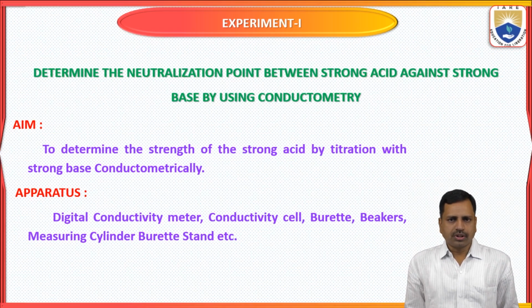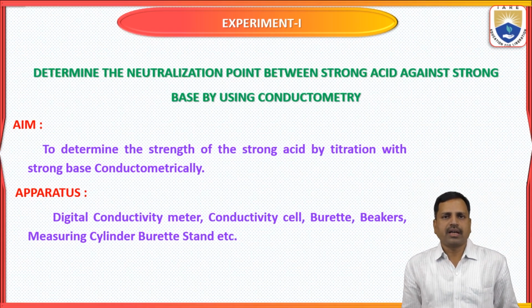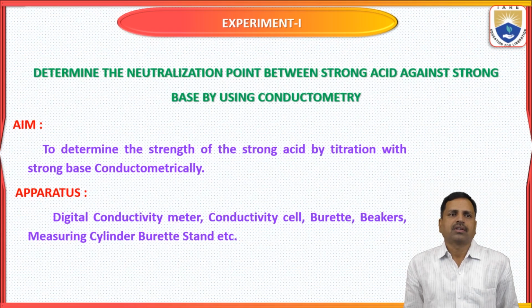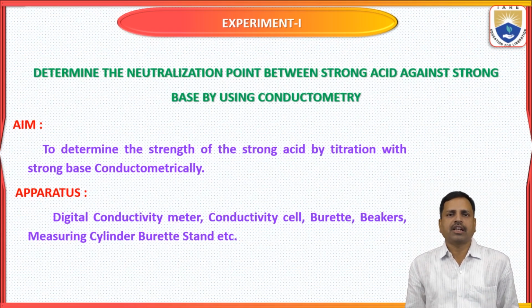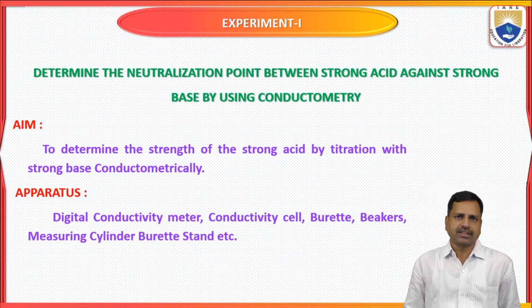Another name for this experiment is strong acid versus strong base, determination of unknown concentration of an acid.